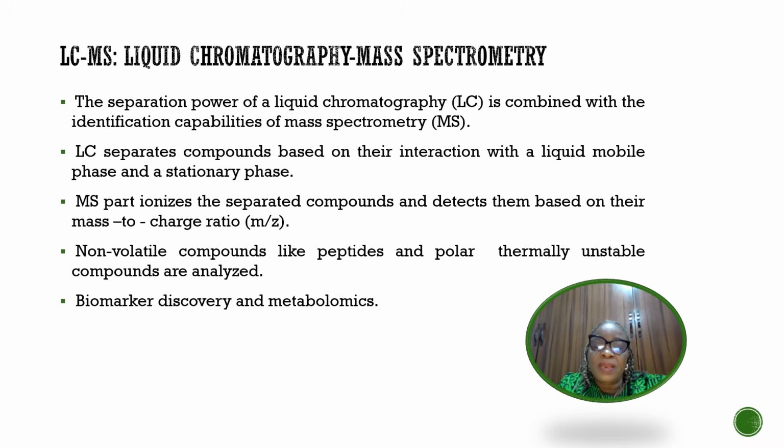It is used for analyzing non-volatile compounds like peptides, polar and thermally unstable compounds, biomarker discovery, and metabolomics. It is very useful for detecting and quantifying compounds in complex mixtures like blood, urine, and food, etc.